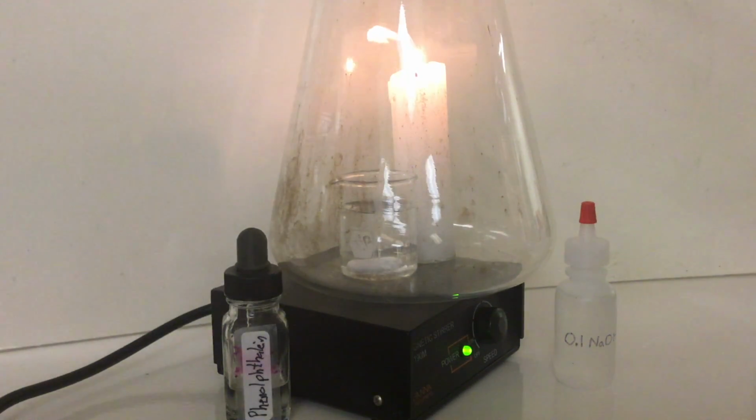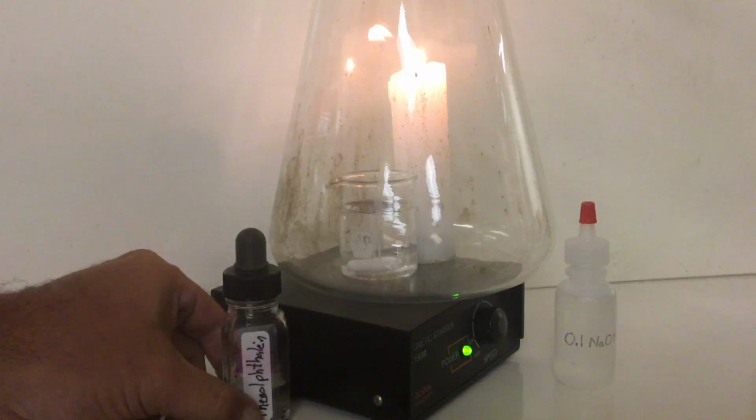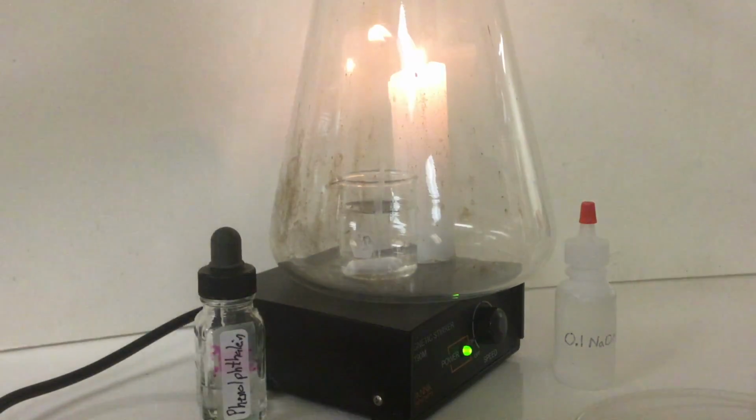So right now the liquid is just plain old pure water. It's distilled water, 100% water. And this is going to be an analogy for something that's occurring right now, something that's very important to all of us, and especially yours and my generation. It's a problem that our forefathers created, and it's a problem that we're going to have to solve. Otherwise, we're in deep trouble. Okay? So this flask here represents the earth. It represents the earth. And that's about all I'm going to tell you. You're going to have to figure out what everything else represents.